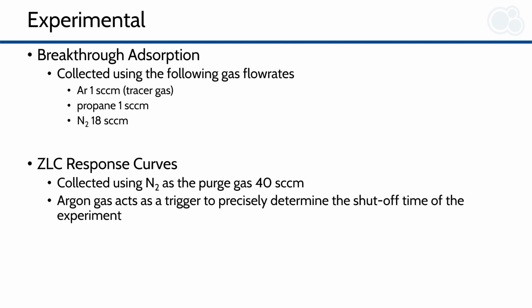and once again, argon acts as a trigger since we shut that gas off at the end of the breakthrough experiment, and we're able to see the slow bleed out of propane over time since it has to slowly diffuse out of the particle that it adsorbed in previously.